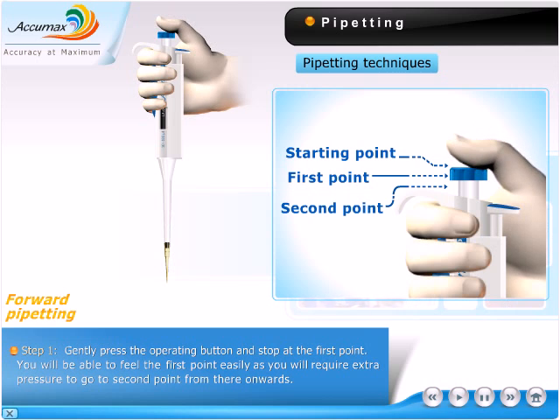Gently press the operating button and stop at the first point. You will be able to feel the first point easily, as you will require extra pressure to go to the second point from there onwards.